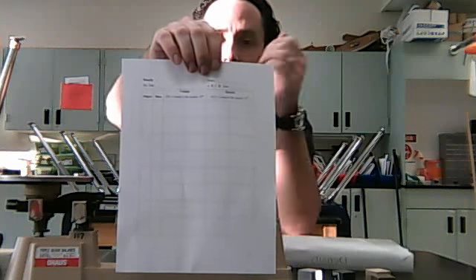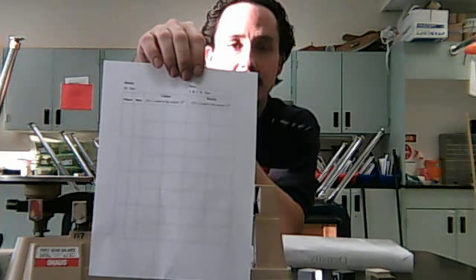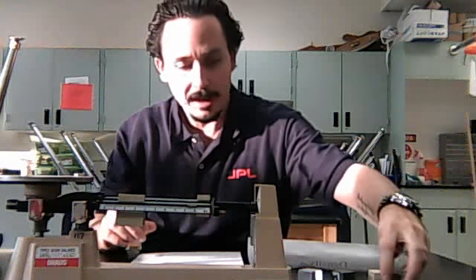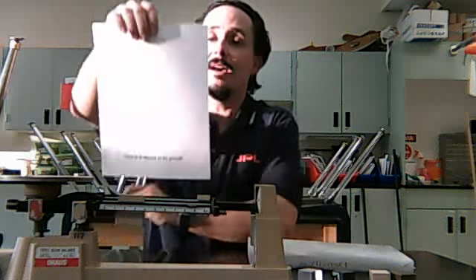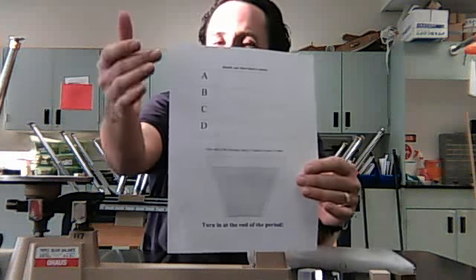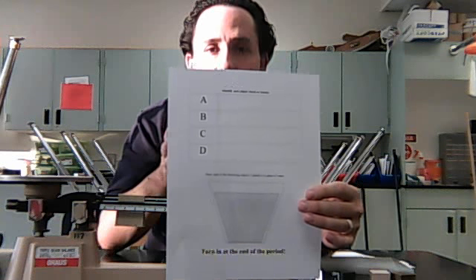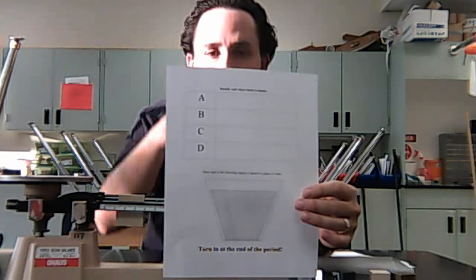Once you're done with that, you'll notice that over here you do have some FICA boxes where you're going to compute the density. Now we're looking for all those perfect things when you do density, such as rounding, filling out the entire FICA, and including the correct unit along with that. Once you have the density of the 4 items that you're looking at here, you're going to move to the back. On the back, it says items A, B, C, and D, but you may need to describe them differently. But you are going to try to identify what those substances are made out of.